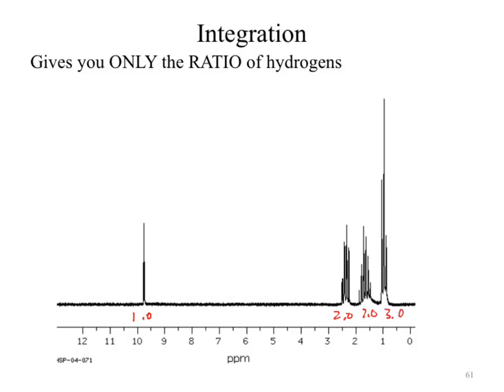Okay? Typically what you would go through and do is on your spectra, you would tell it to integrate that area. You'd say that area is 1. Why do you know that area is 1? You ran the spectrum. Would you run the spectrum of an entirely unknown compound? Probably not. You're probably running it on something that you made. So theoretically, you know what you made. There might be a 1 hydrogen signal in there. So you would tell it to integrate that to 1.